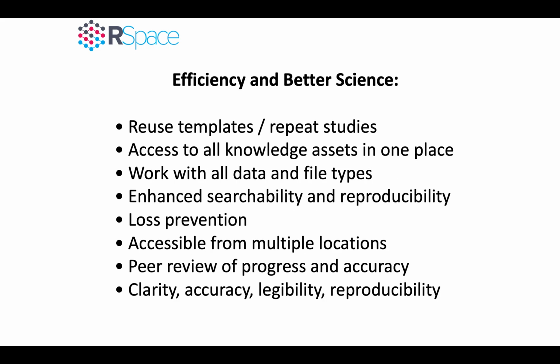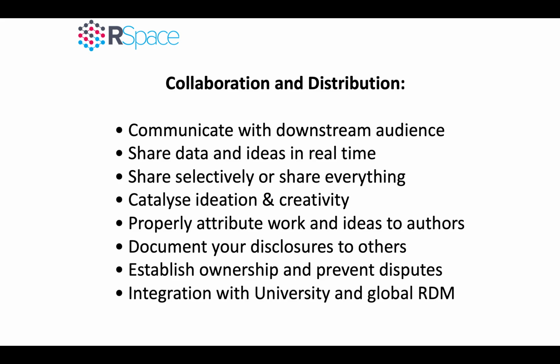RSpace can be used to boost the efficiency and productivity of your scientists and help make sure that their work is recorded with clarity, accuracy, and that it's legible and reproducible for future generations of scientists. RSpace also helps with collaboration and distribution of your work. Scientists can choose to share documents with specific individuals, or if your lab has a very open culture, you can choose to automatically share everything that you do with your entire lab group.